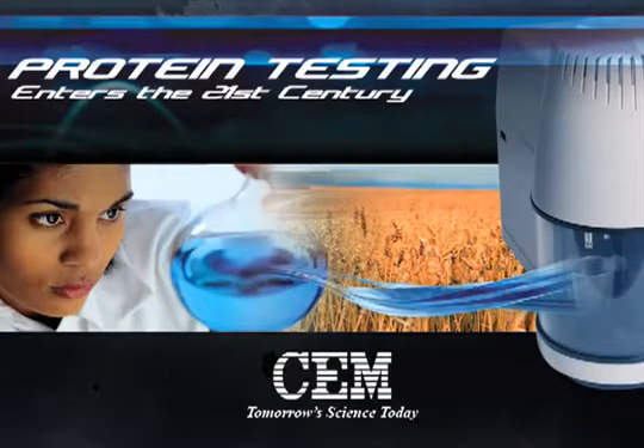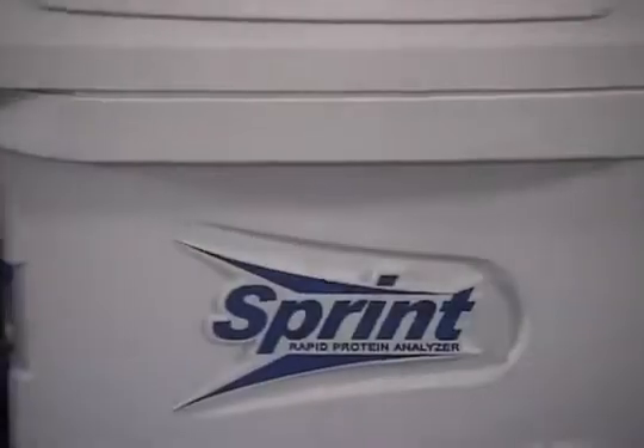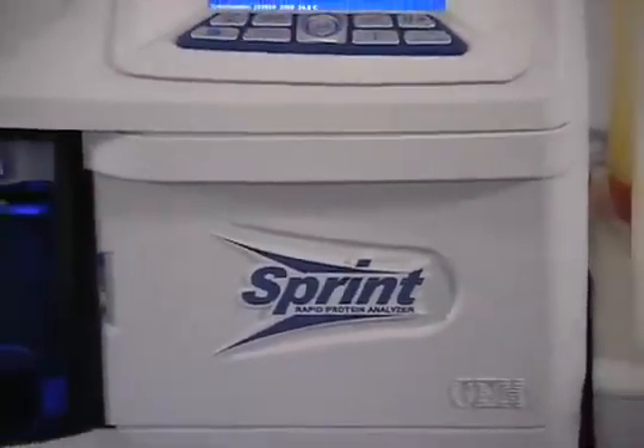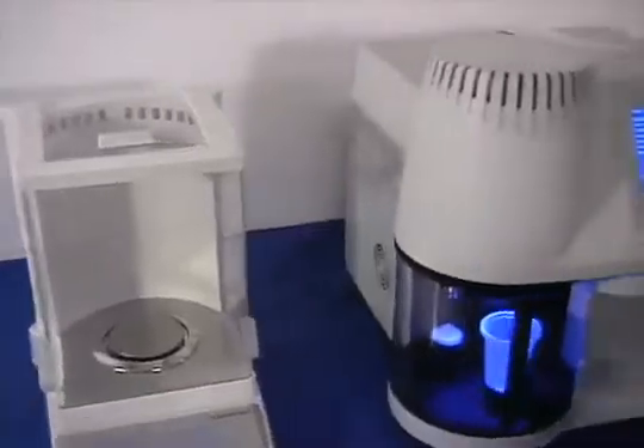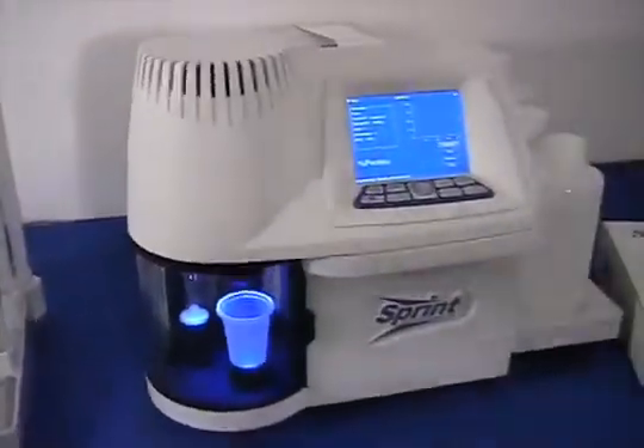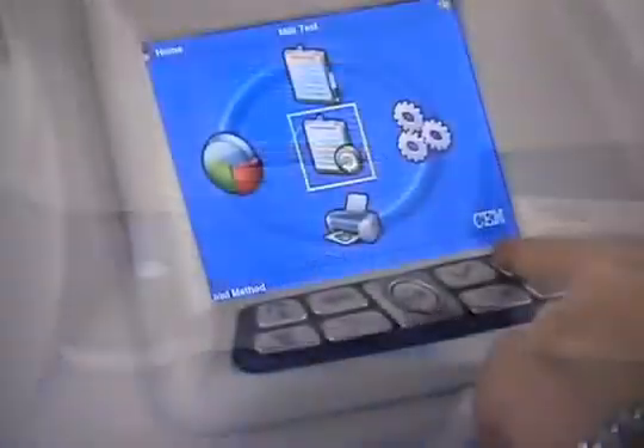The measurement of protein content is a critical factor for the control of quality, market pricing and regulatory compliance for food and food ingredients. CEM is proud to introduce the Sprint Rapid Protein Analyzer with revolutionary ITAG technology for the rapid, safe and direct determination of protein.